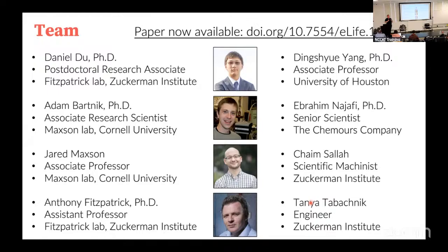They put a physical box into the microscope, so you have to have a cavity. And in fact, I believe, though I'm not sure, Ed would probably know better than me, on the Krios 5 you can now actually buy a Krios 5 with that extra space if you want to insert a resonator, let's say.